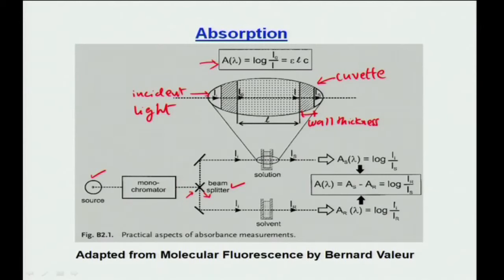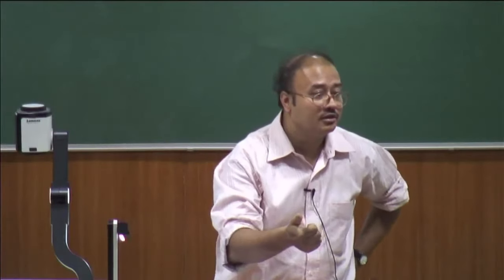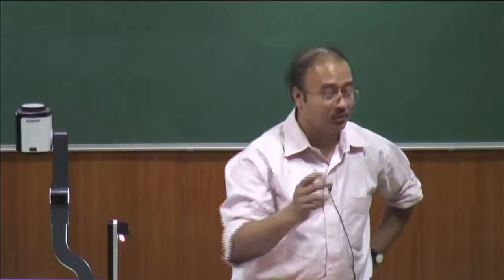So, suppose in this one, S stands for your sample, and here, this one is IR, where R is your reference. Now, what do I mean by that? That means suppose you have taken a compound in a certain solvent, which is a sample. The reference is typically the one which does not have the compound, that means it is only the solvent for you.